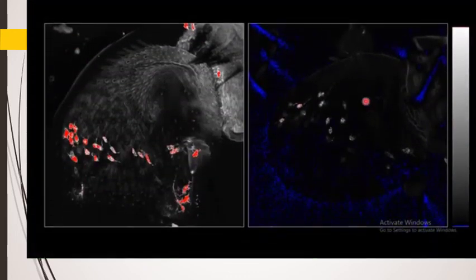Now here is an image where you can see the gain is increased too much. That means way too much voltage is injected. That's why you are seeing everything is saturated. So this kind of paradigm is not proper.